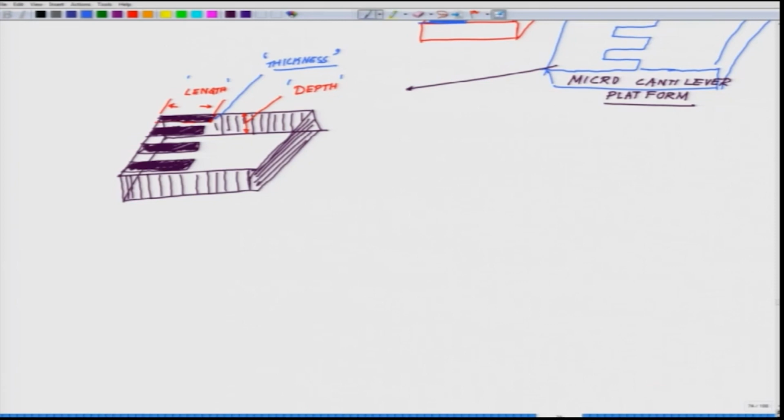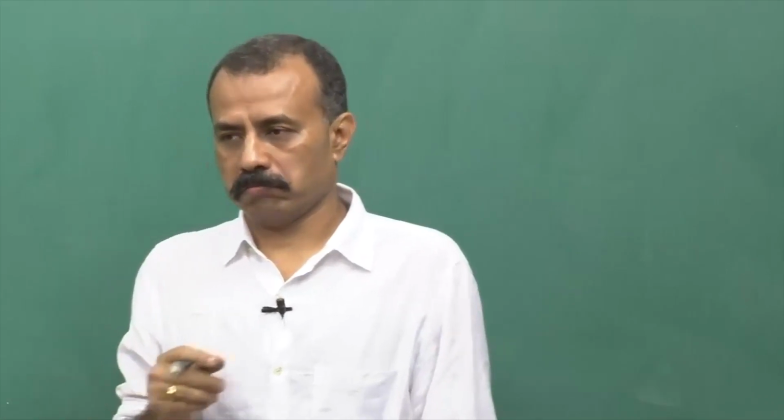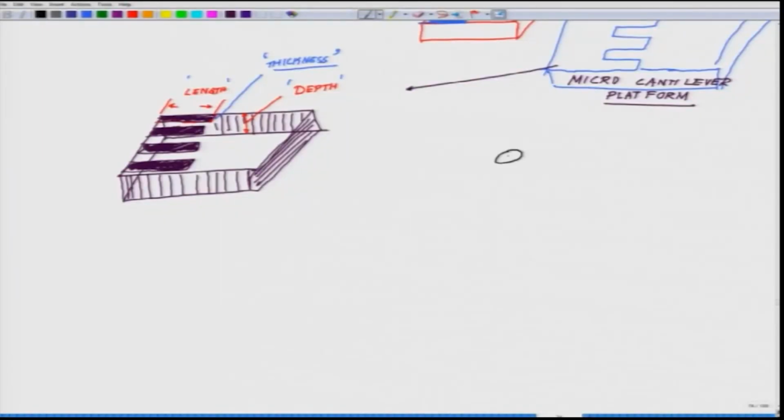Now, for example, a case study. We wanted to measure the force generated by skeletal muscle. So, let us visit the skeletal muscle biology as a backup. You have these muscle cells in a culture, and we wanted to do that in a culture. These muscle cells divide, and post division, they align like this, and post alignment they merge like this.